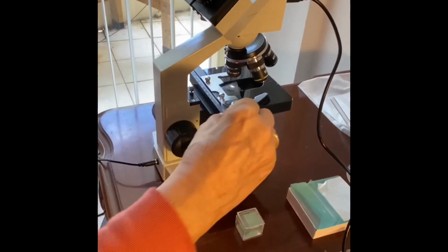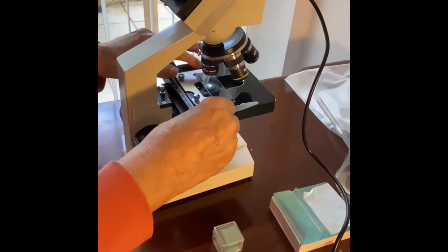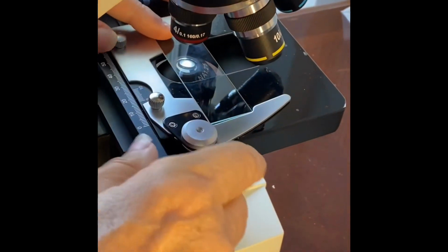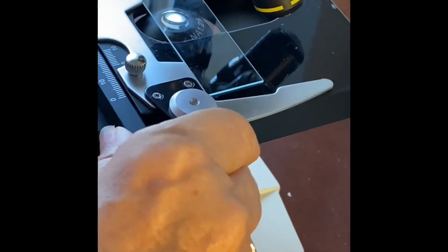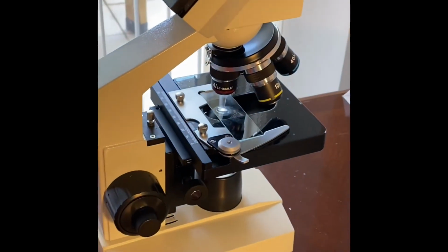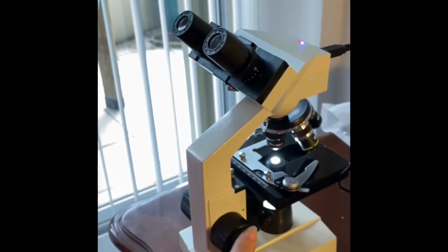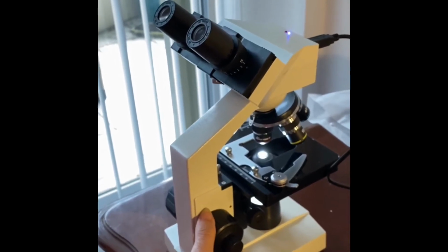Now, to put in the slide, like I said before, you just take the arm and release the knob, and you will put the slide in. This is the coarse adjustment, which allows you to focus the microscope.